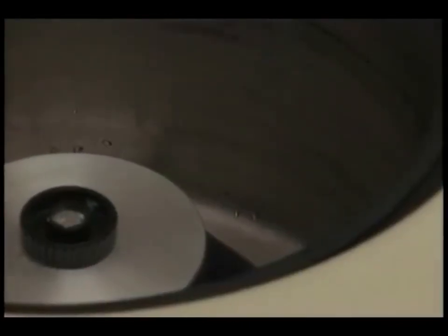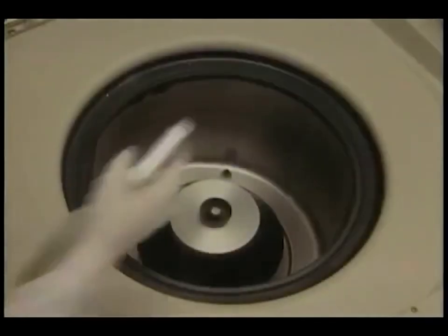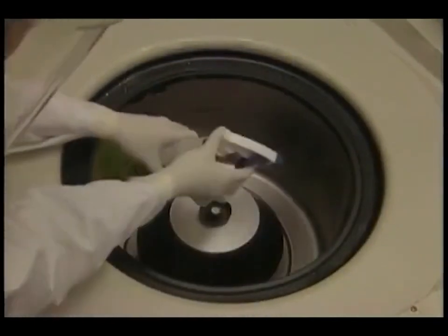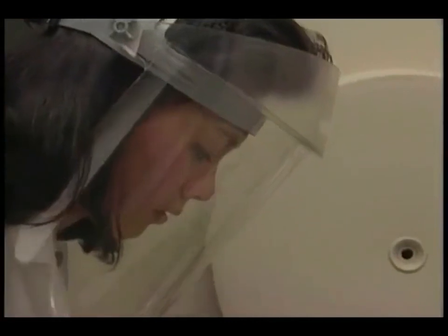If there is any evidence of a spill in a centrifuge, close the lid and allow at least 30 minutes for any aerosol to settle. Spray with detergent disinfectant and then wipe down with alcohol.